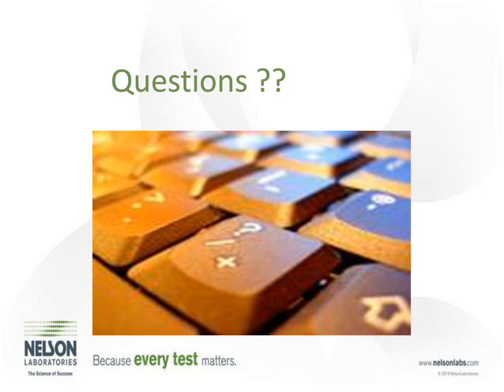Great question. How ISO 10993 is written, we're only concerned about the patient contacting portions, directly or indirectly. The reason is that we're working off surface area. Let's take a device where the patient contacting portion, the distal end, is very, very small. That's the portion we're concerned about because that's what goes into the patient. But if we include all the shaft and all the handle that the clinician is touching, then we would be diluting out the distal end of that device, what really is impacting the customer. It could be toxic, but if we include all this other safe material, we wouldn't know that. If you do want to test clinician contacting portions or other portions of the device, we're never going to turn down testing, but just be careful what test you do and make sure it's separate from the patient contacting portions.